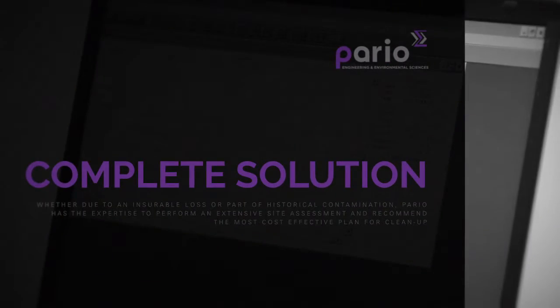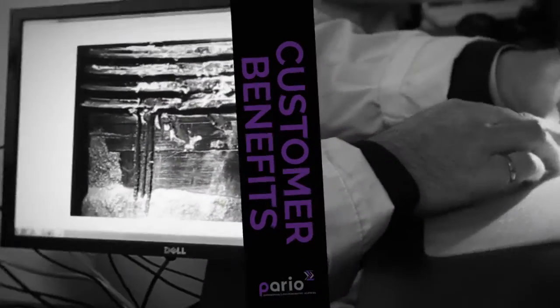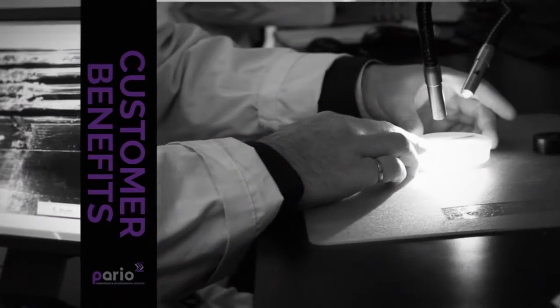The advantage what we have here at Pario is that we have all equipment needed for completion of the investigation under one roof. That saves enormous amount of money to our clients.